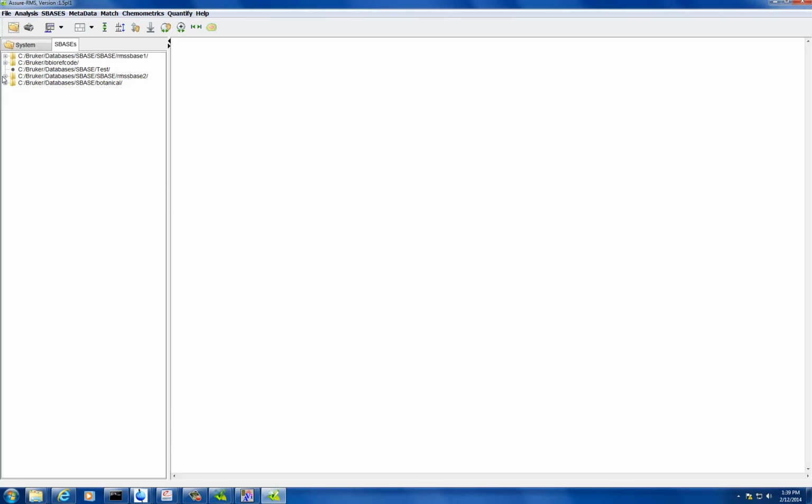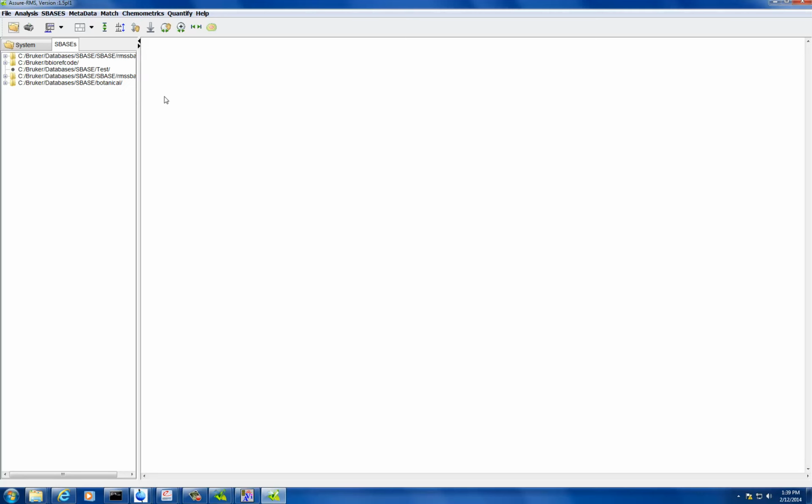People are like, what? So let's make a method and run the method, and we can try to quantify something. So let's see. Why don't someone do it? And then I will lead the way. So at least someone clicks on it. I feel like I'm the only one clicking on it. Yeah, you want to, and then we'll take turns.